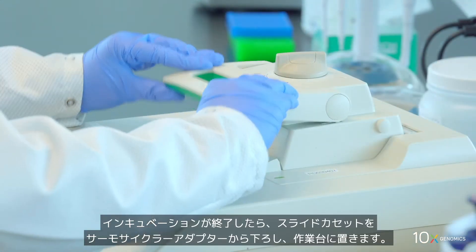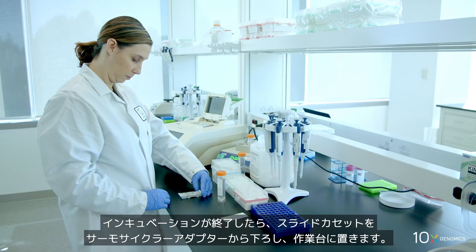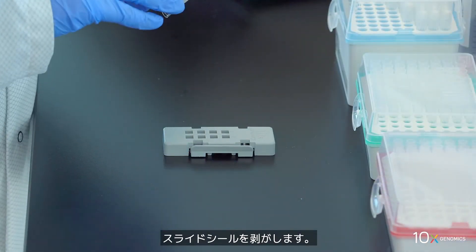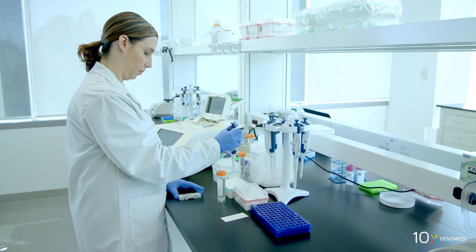At the end of incubation, remove the slide cassette from the thermocycler adapter and place on a flat clean work surface. Remove the slide seal, then remove tissue removal mix from the wells with the pipette set to 100 microliters. Next, we will remove the slide from the slide cassette.